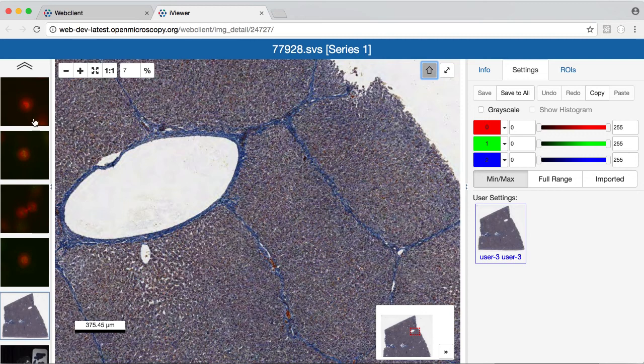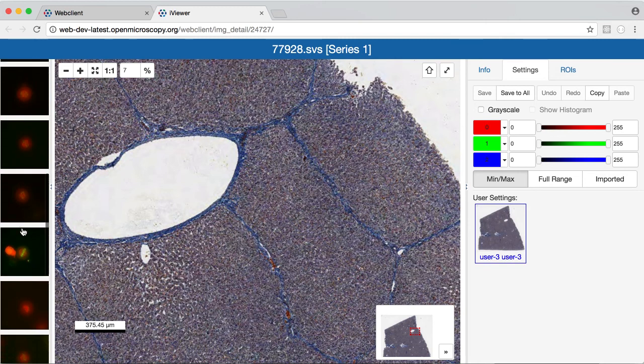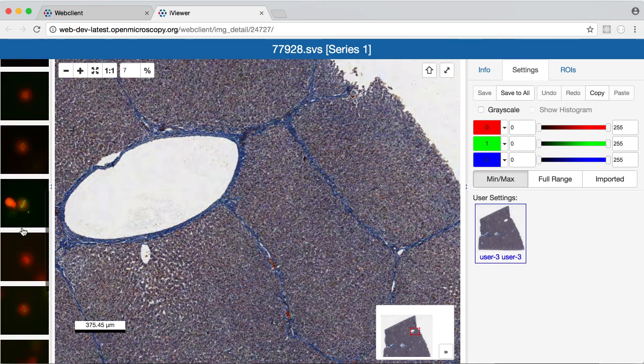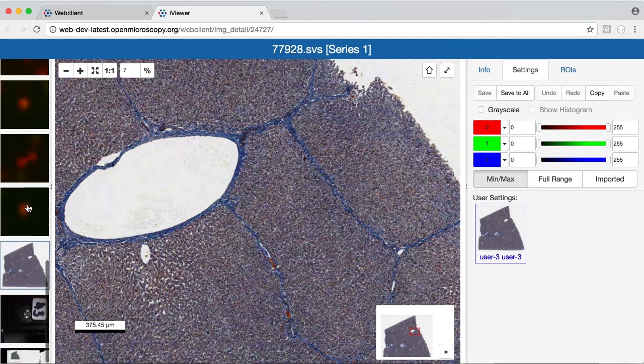Thumbnails for the current dataset are shown on the left here. I can browse through those and open additional images.